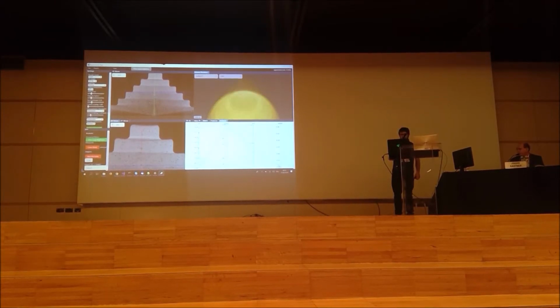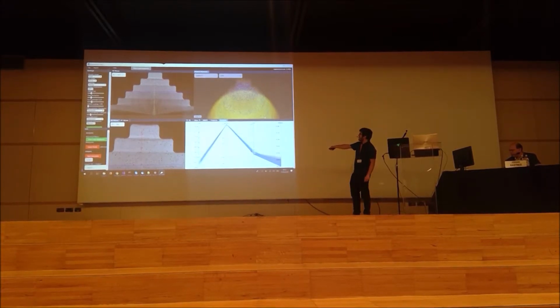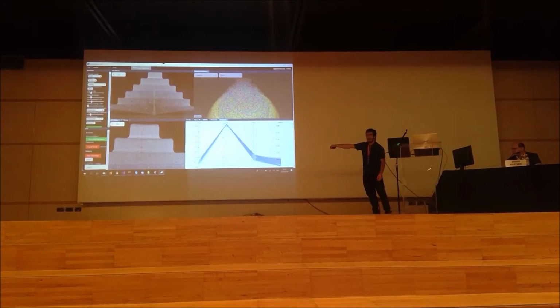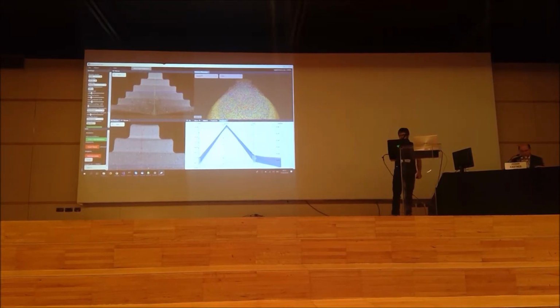What's interesting here is that if I use an average filter, you can see that now within this range from 0.125 to 0.35 of density, normalized density, we have this window here, and we can now move this window and say, okay, if you move down, the features in the upper area here go away, and in the lower area they arrive because of these inhomogeneous intensities we have from the CT artifact.